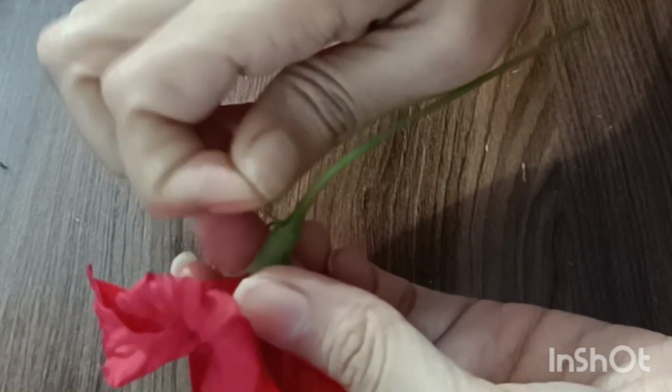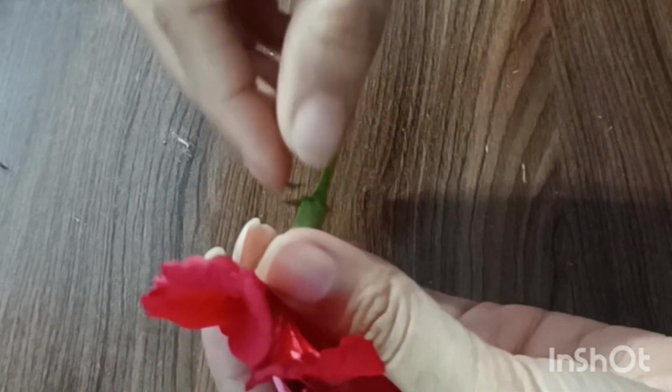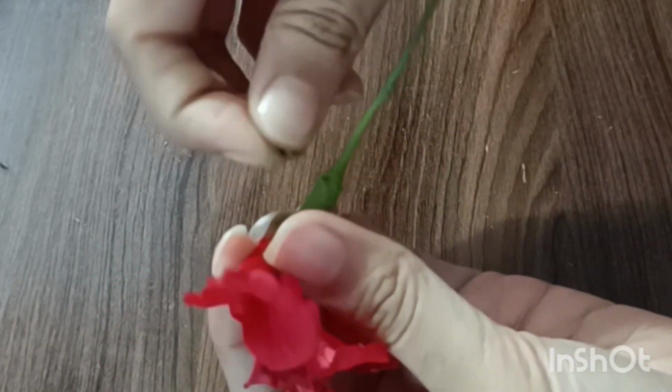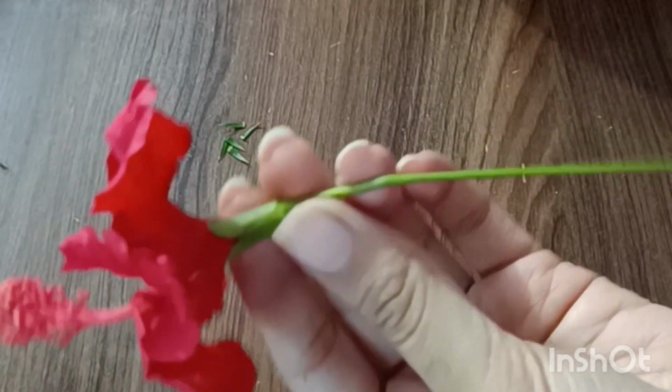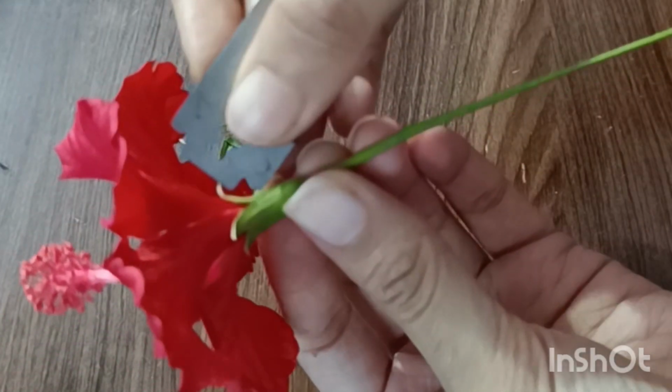Next, I observe the calyx. It consists of 5 green sepals. Sepals are gamosepalous, fused. Function: protection of the inner floral parts.